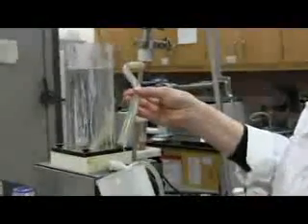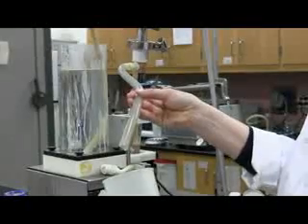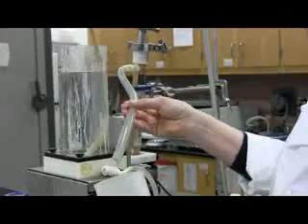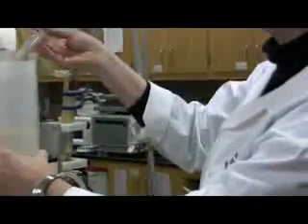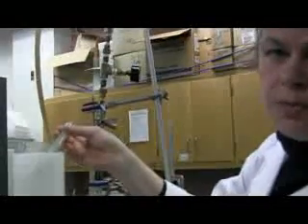Think about that for a second. Are you going to try to measure that in a 10 milliliter graduated cylinder with a stopwatch? I have a better idea. Why don't you fill the beaker, weigh it, and use the stopwatch? Determine how much time it takes to get enough flow out. That's going to give you the most accurate reading for your flow rate.